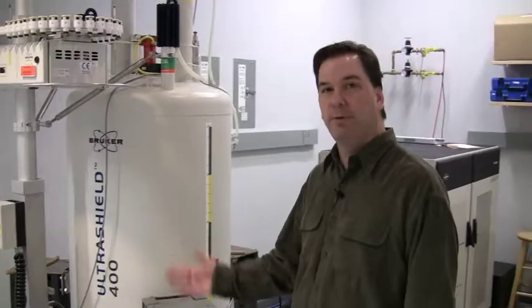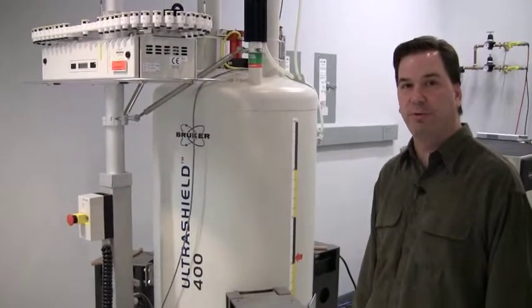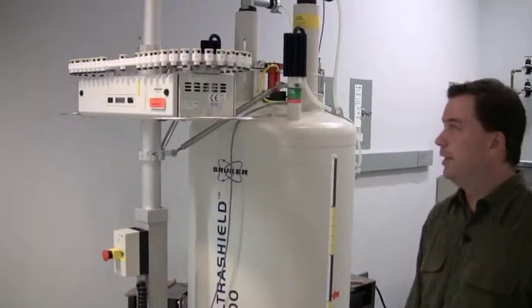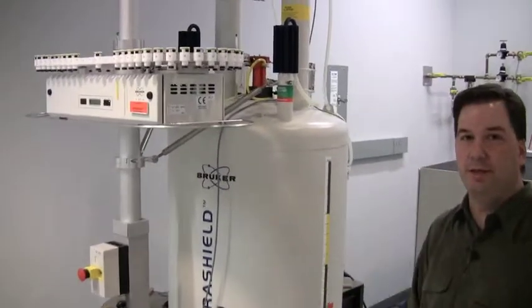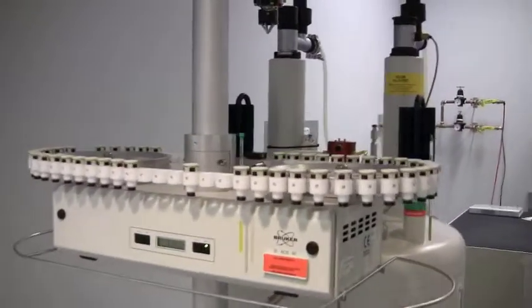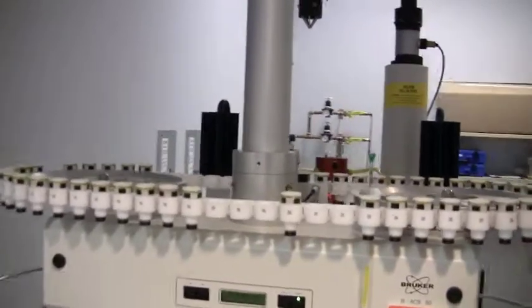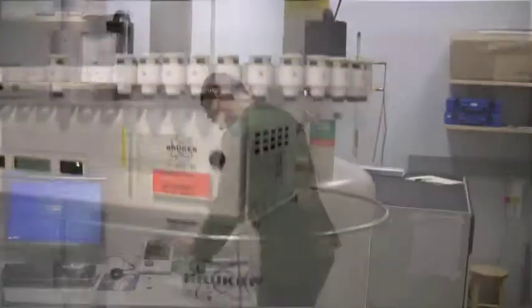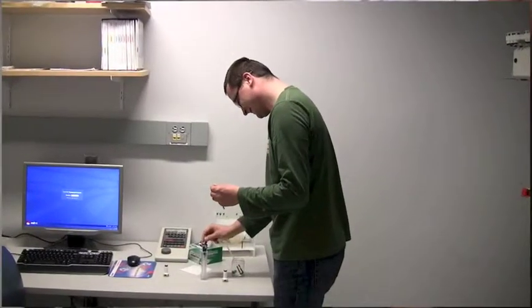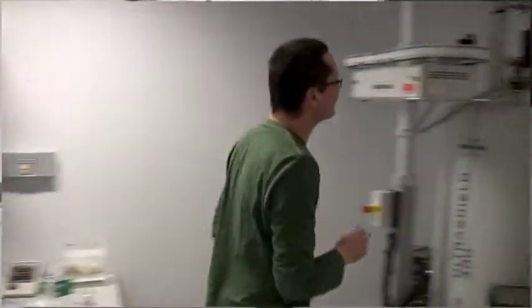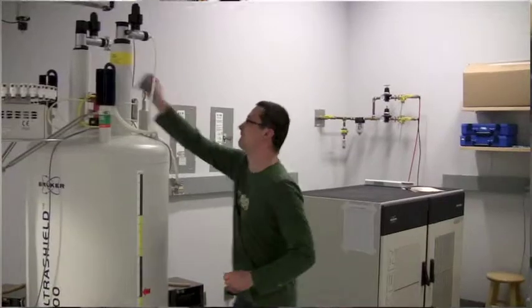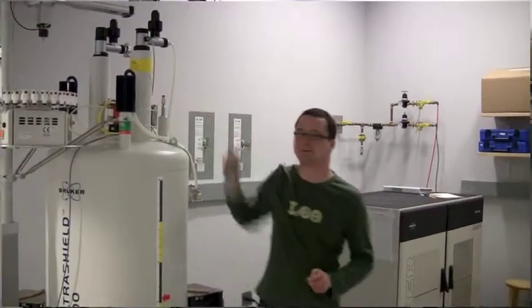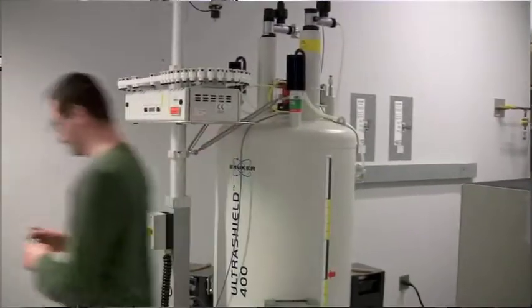This is a 400 megahertz Bruker spectrometer. As you can see, it also has the BAC-60 sample changer on it. The sample changer once again comes on at 4 o'clock every afternoon, and it offers our users the ability to just put samples on the changer, enter some data into the software, and have the instrument automatically record their NMR spectra.